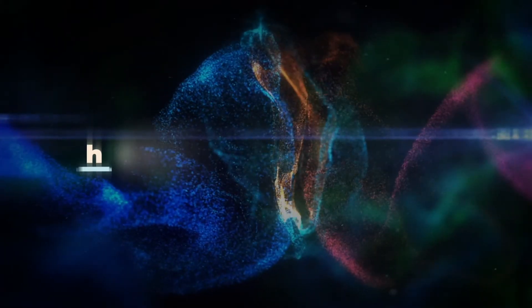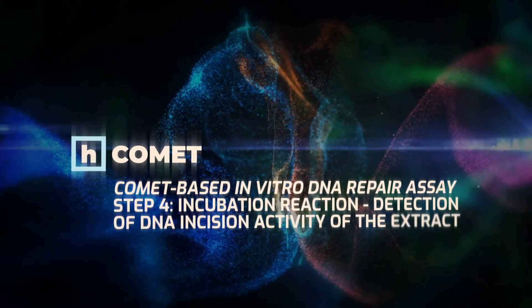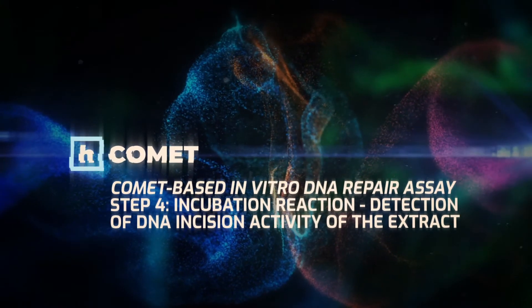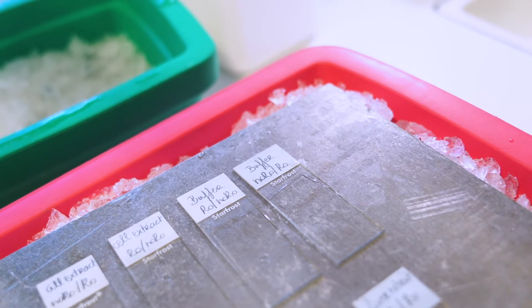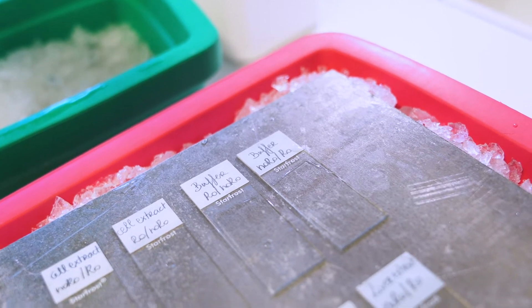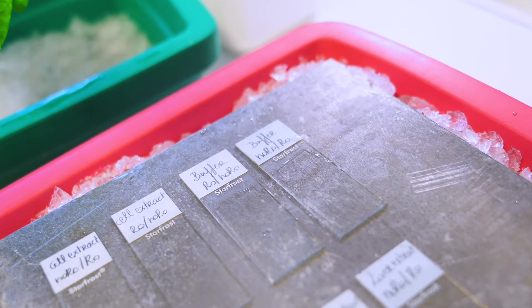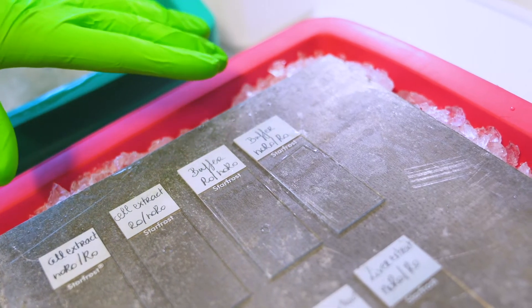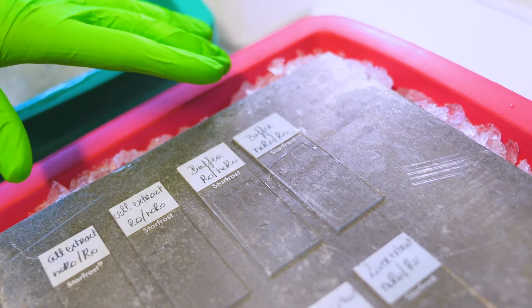So now let's show you how to incubate this to actually study DNA repair. Okay, so now we're going to incubate the protein extracts with the substrate cells and the setup here is for a base excision repair assay as an example.